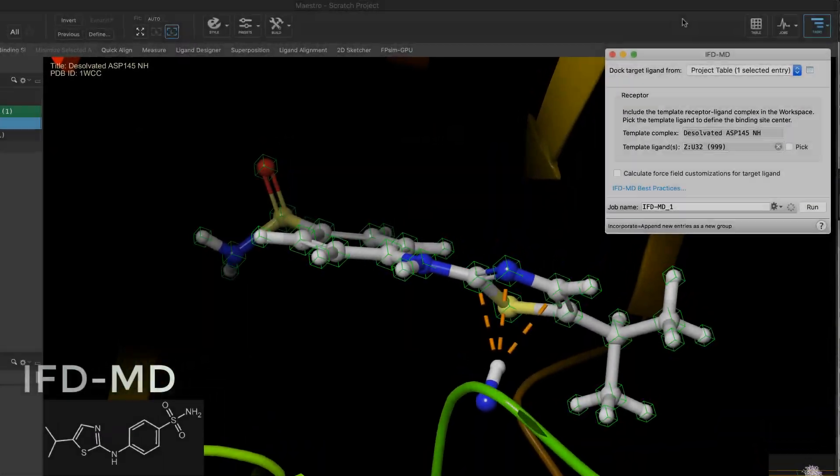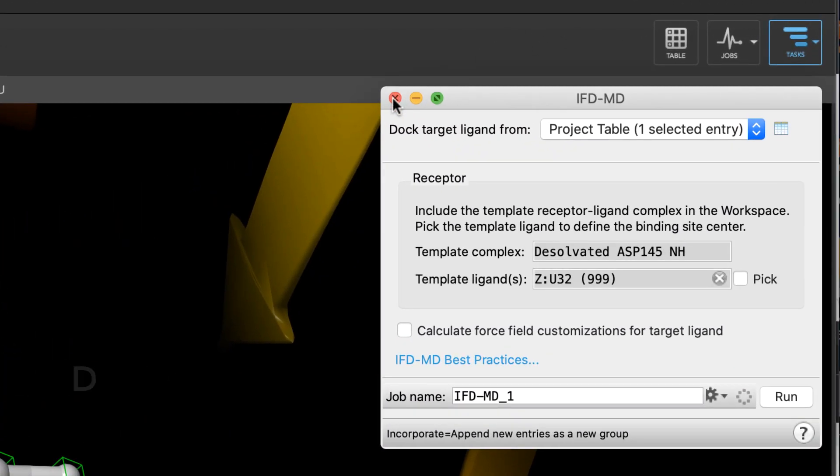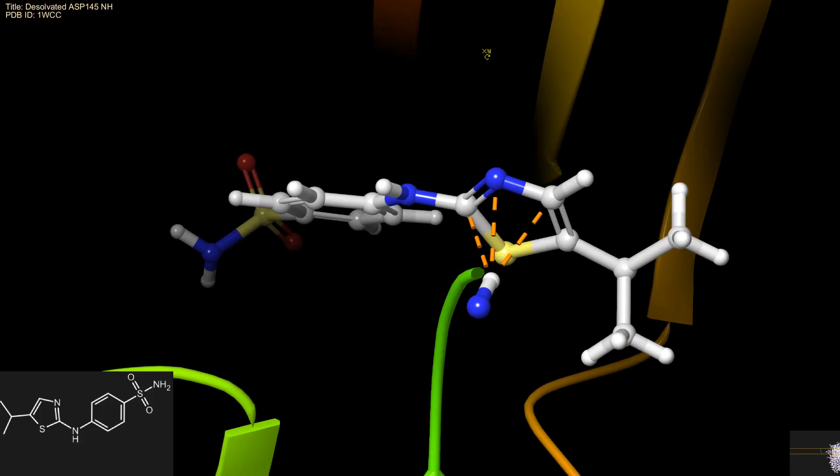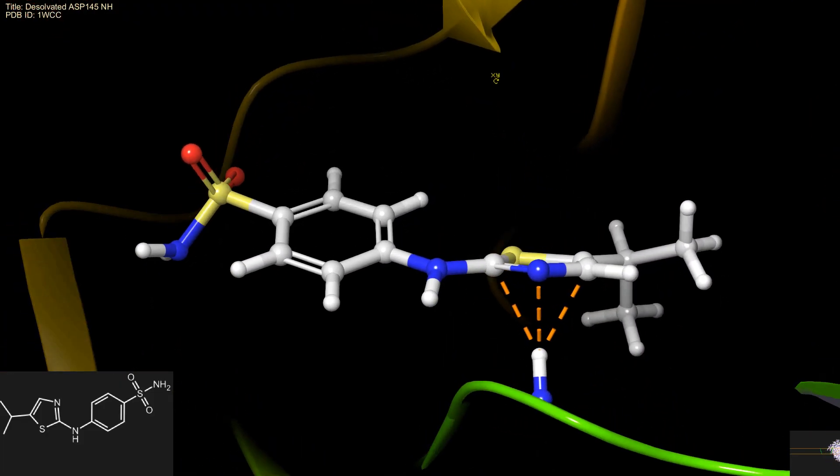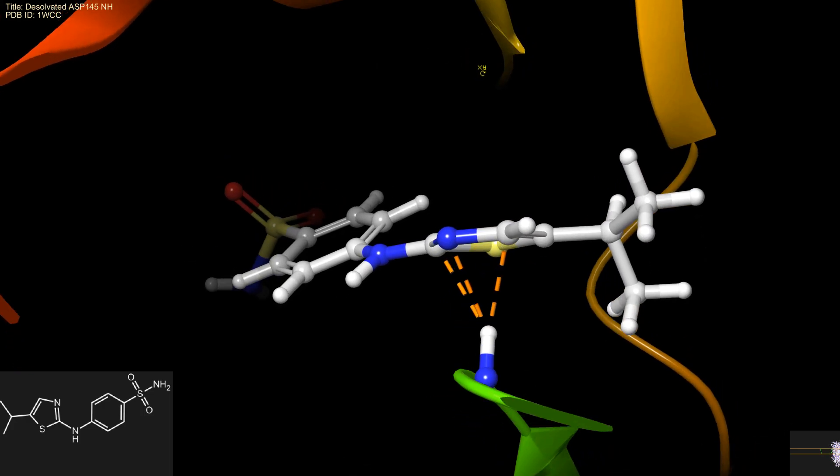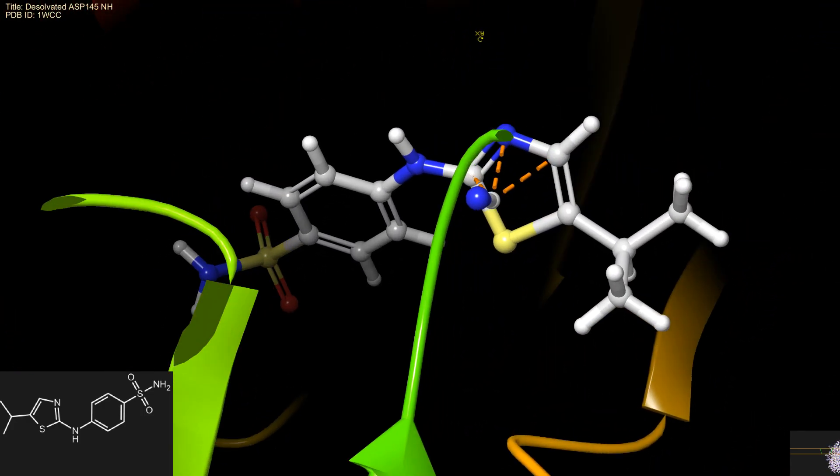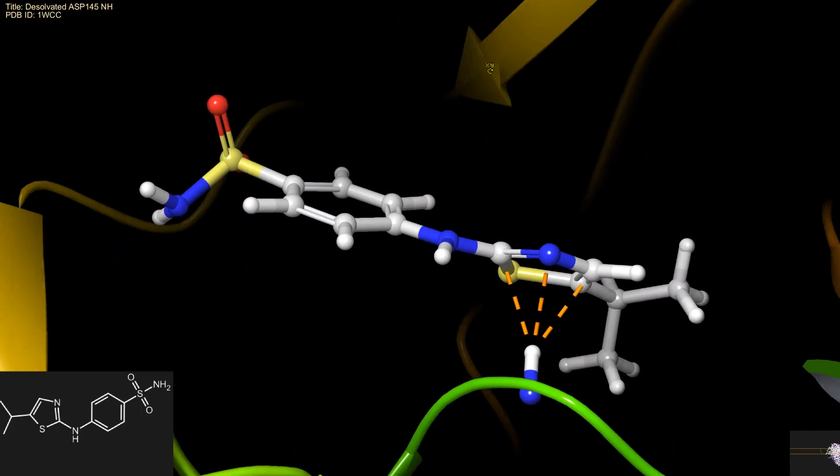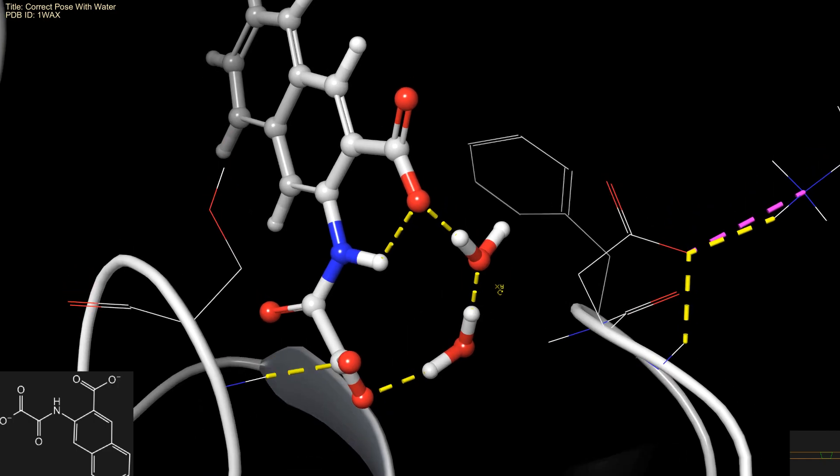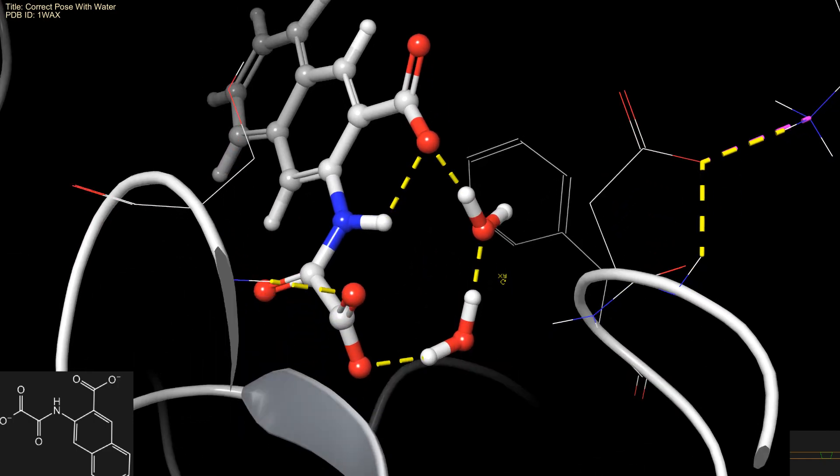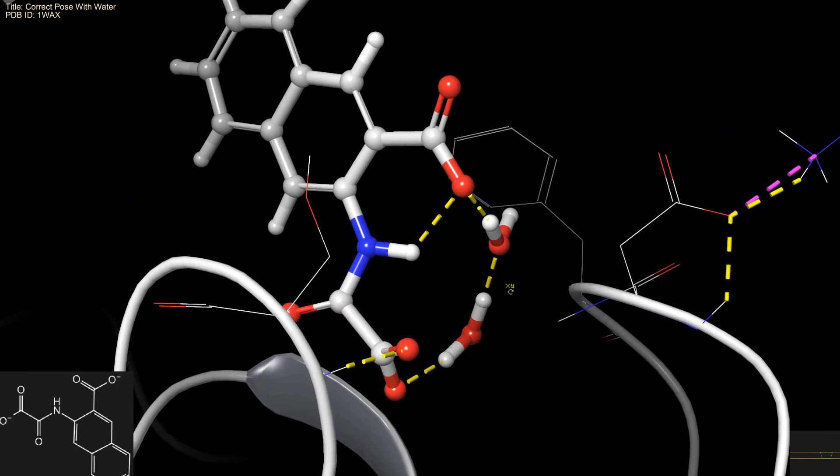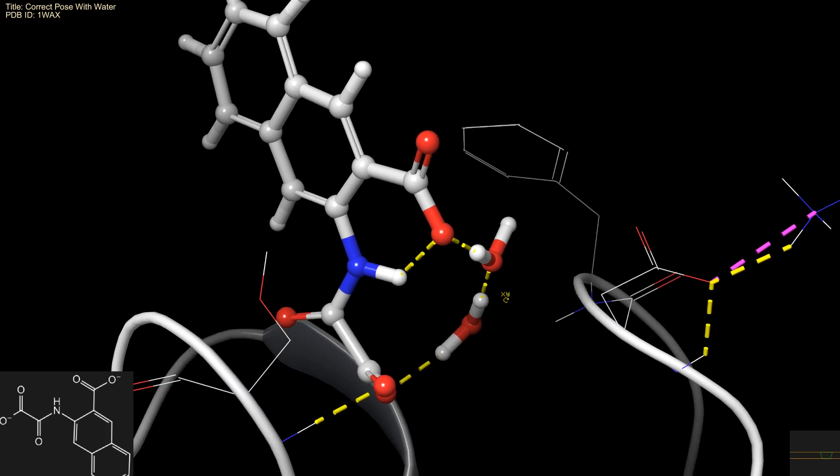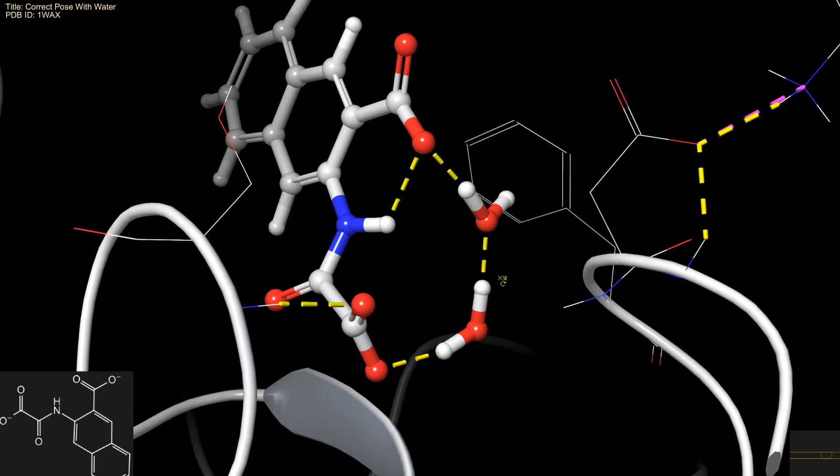In 20-3, significant performance improvements were made in IFD-MD. It now contains a novel triage stage to remove unphysical poses which dissolvate polar groups. By removing poor quality poses early in the algorithm, the more expensive GPU calculations are reserved for more promising poses. And this provides an overall speedup of 5 times compared to previous IFD-MD releases.